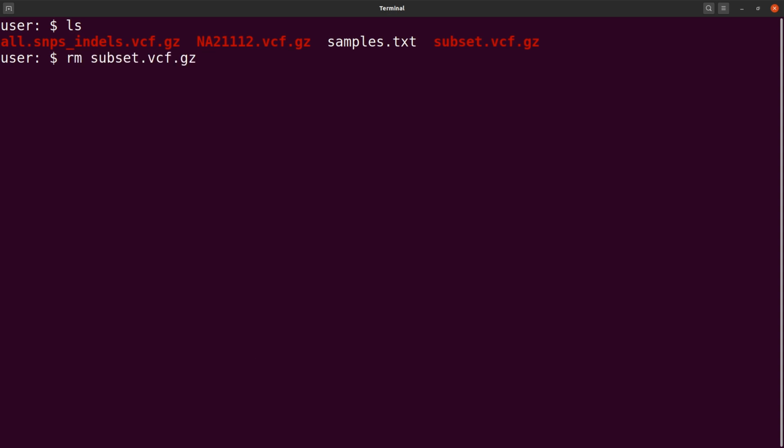We'll come back to it. And let me say that the rm command permanently deletes your file, so you should be careful when using it. But for this tutorial, we are just using it. And that is why we created a directory where all these files are stored in. So let's do an ls again. So this time, we are going to what? Get this same, let me issue this one here.